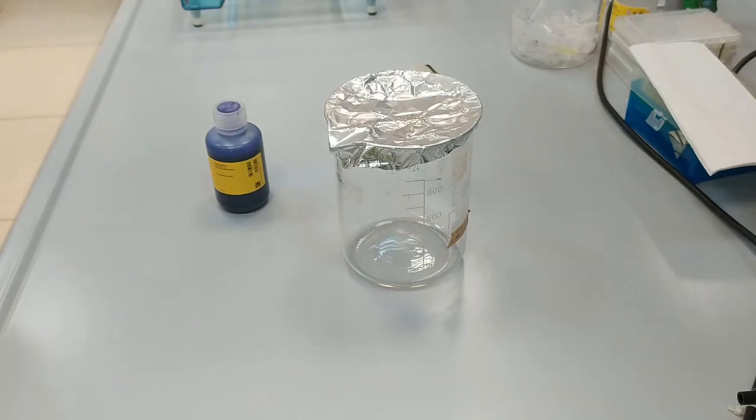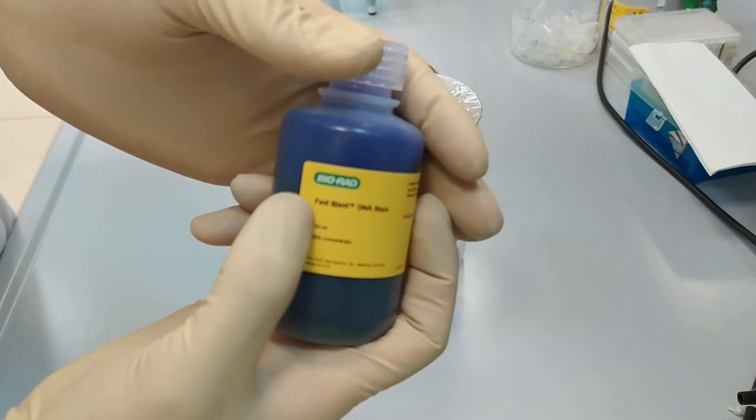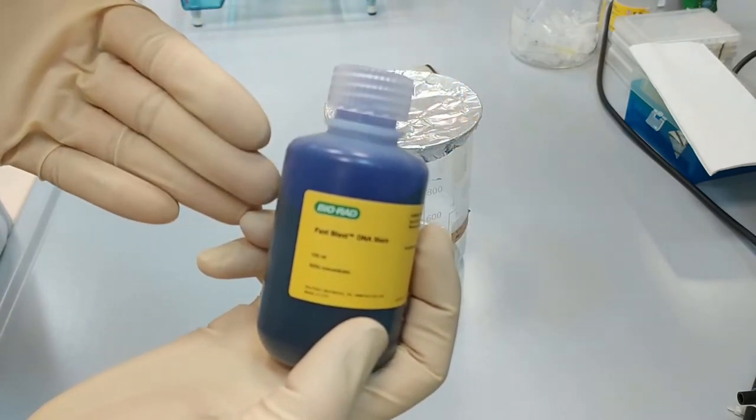Okay, so now we are preparing the Fast Blast. It is the dye that we are going to color the bands with DNA.